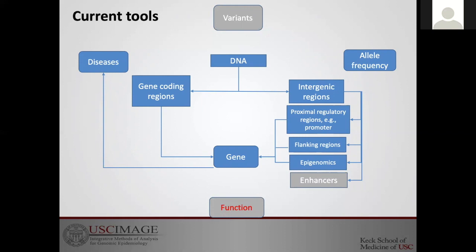Although enhancers can be annotated to the variants, there's very little functional data linked to these enhancers. So if you want to run any annotation using these tools, you have to set up each individual tool by yourself, and that's a tedious job. It also takes a lot of upfront overhead.